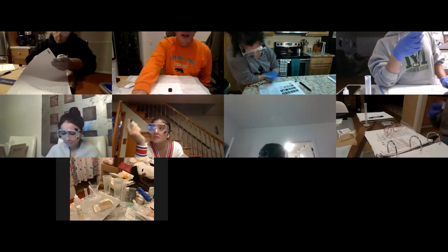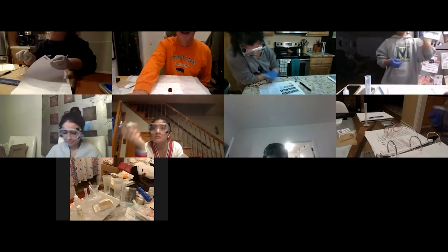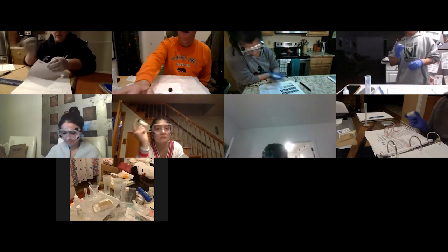Oh yeah, it does say to shake it for 5 to 10 minutes, doesn't it? Yeah. Sorry, I doubted you, Vera. Man, all right. Start the clocks.